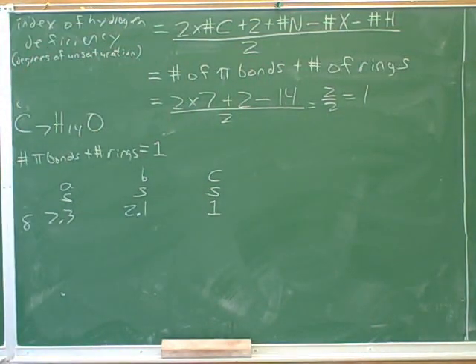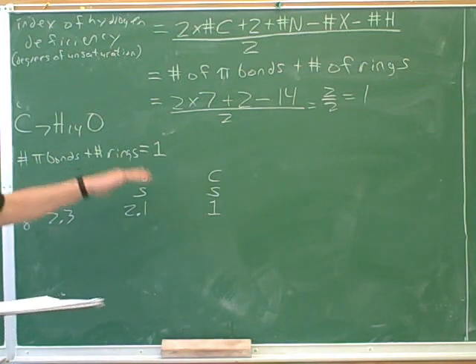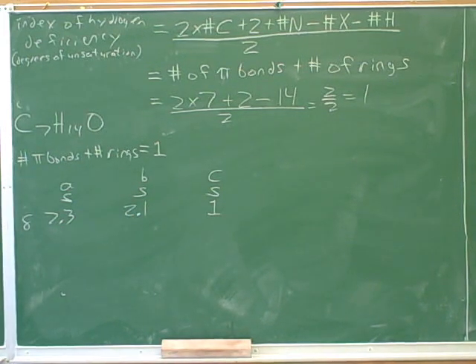Are A, B, and C just randomly defined, right? You could call them whichever you want, A, B, and C. You might as well do it from left to right, though. That's right. Those are just our reference letters. And S stands for singlet? That's right.